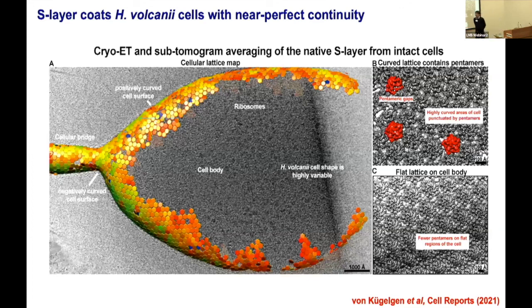Excellent exploitation of all these methods. How important is the influence of the electron methods on the structures you're measuring? Do you have a gauge? Radiation damage is the underlying question. Well, I think the radiation damage differs from species to species. We have studied some species which are really highly radiation sensitive, and some that are less radiation sensitive.